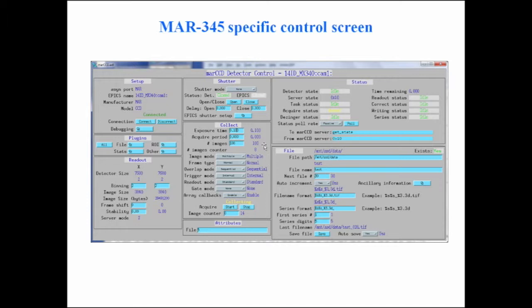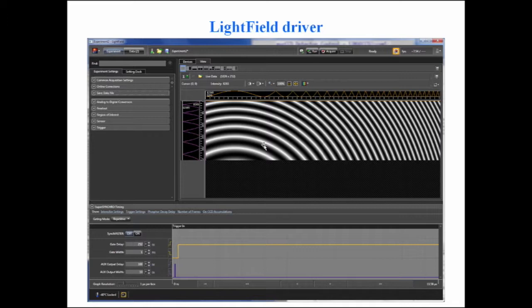This is the MAR345-specific screen with a different set of specific parameters. We try our best to make the file saving controls look the same regardless of which detector you're using, though there are some differences — for example, the MAR345 server has a hard-coded file numbering scheme.